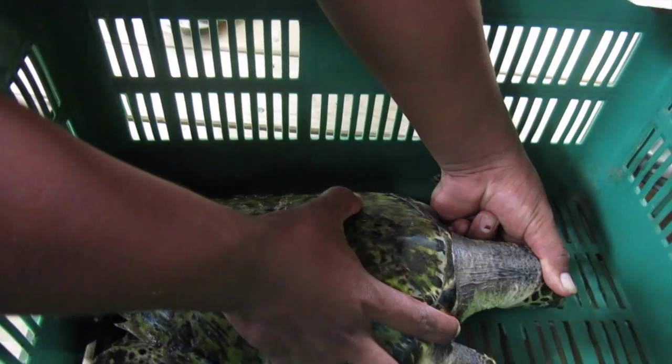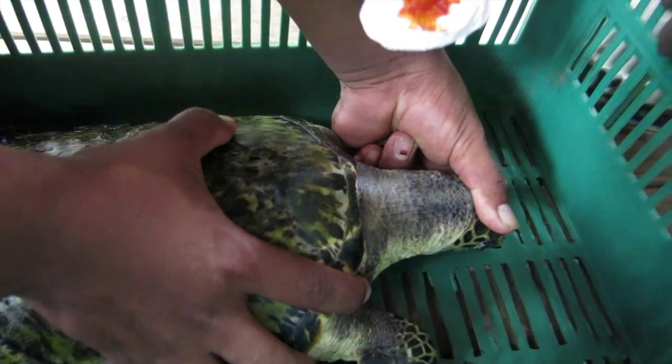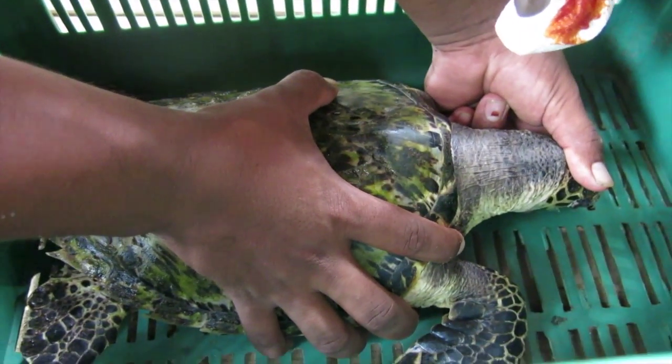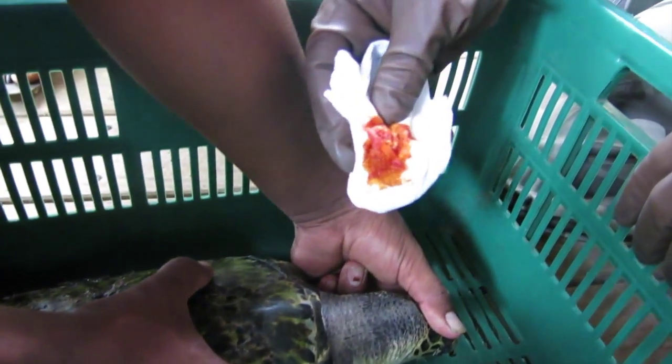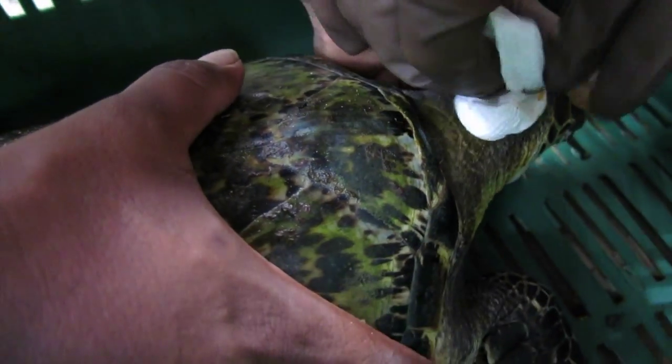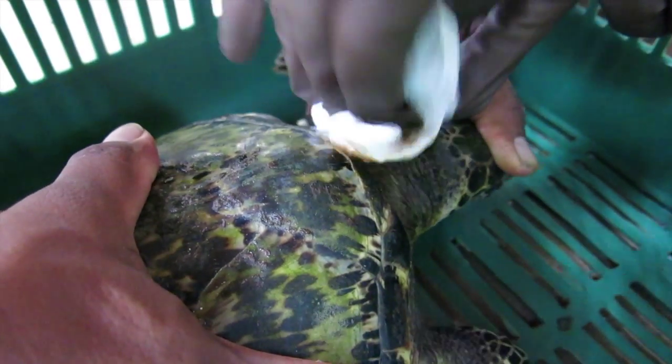This afternoon we're going to be taking blood from a juvenile hawksbill turtle, probably about 25 to 26 centimeters long. The first thing we're going to do is just swab the neck with a little bit of iodine to clean it off.